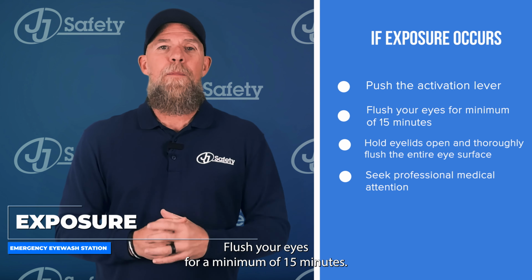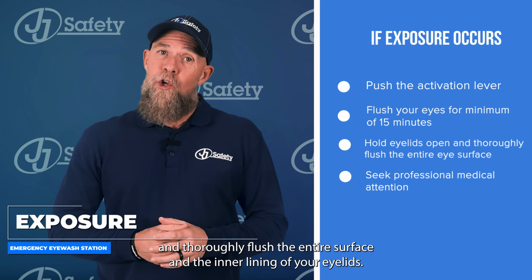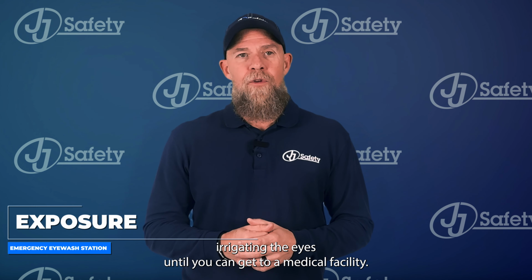Flush your eyes for a minimum of 15 minutes. Hold the eyelids open and thoroughly flush the entire surface and the inner lining of your eyelids. Then seek professional medical attention. In some cases, you may have to continue irrigating the eyes until you can get to a medical facility.